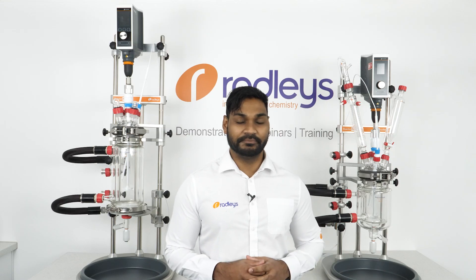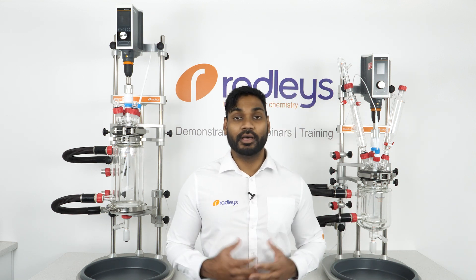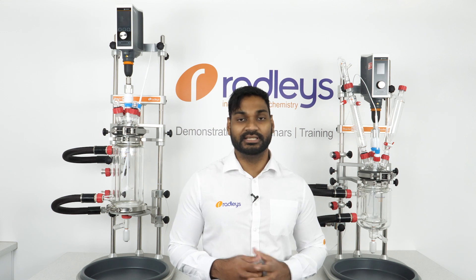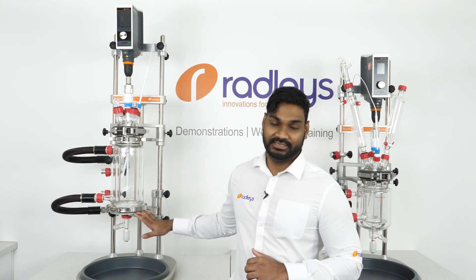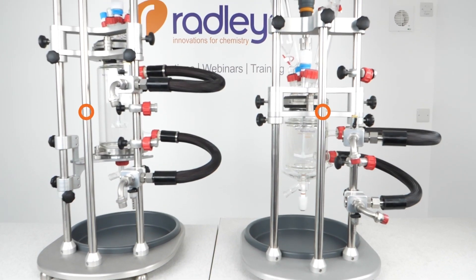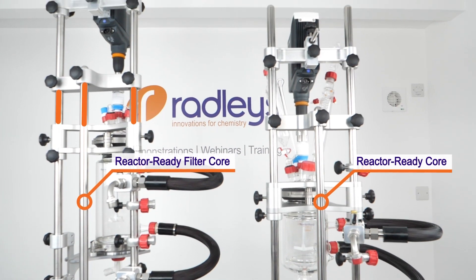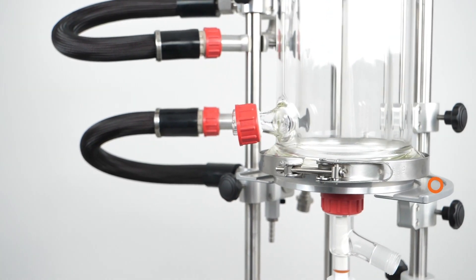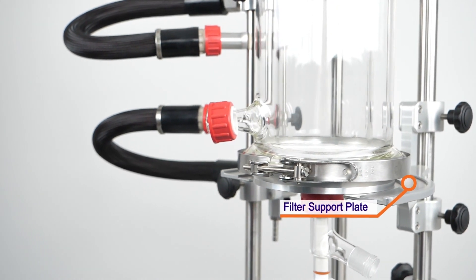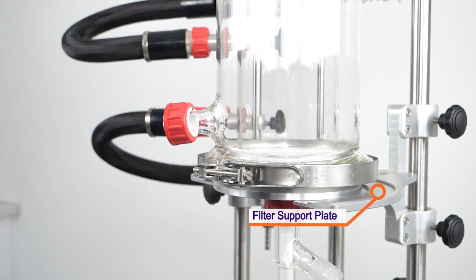Our new filter system is based on our popular Reactor Ready Lab Reactor. You can either upgrade your existing Reactor Ready to accept filter vessels, or you can buy a new dedicated filter system. The Reactor Ready Filter Core is identical to the Reactor Ready Core, with the exception of extended support rods which accommodate the taller filter vessels, and the filter support plate that assists with holding and aligning the filter plate.